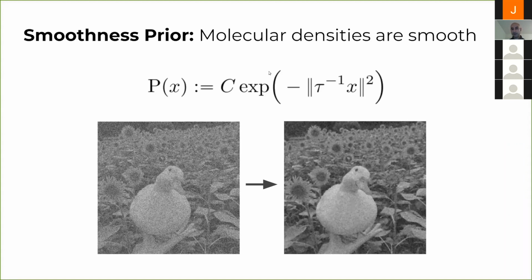And that's basically the only information that this prior introduces into the reconstruction, that we require things to look smoother, because we know that proteins, for instance, in the solvent regions, the reconstruction shouldn't contain higher frequency noise. It should be smooth.